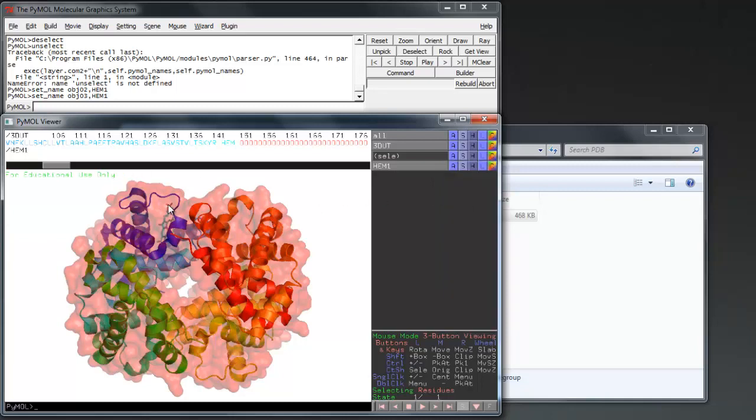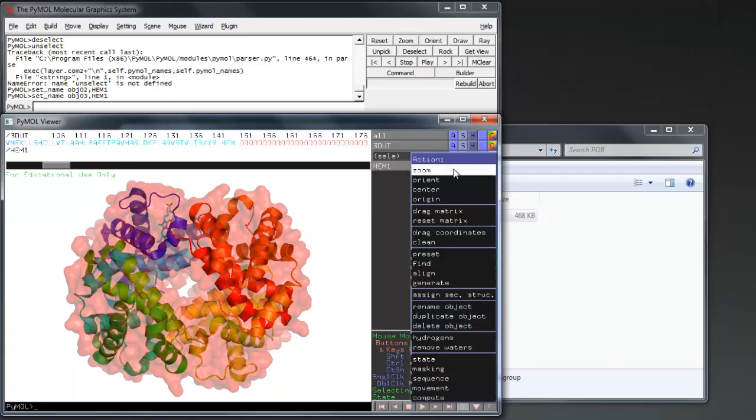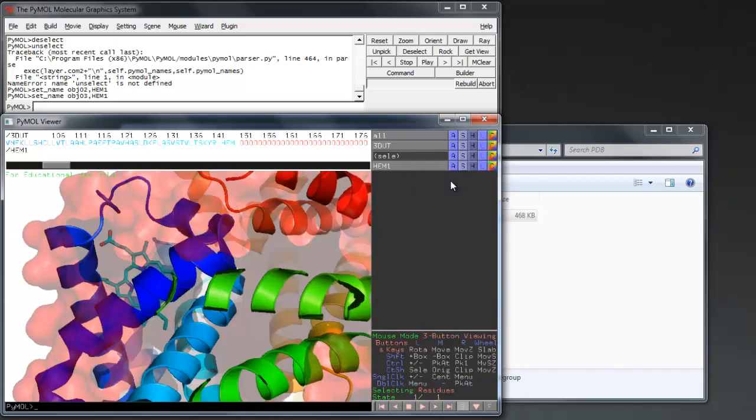Select your residue via the bar, then copy to object from the action menu before renaming it. Show your residue as sticks to accentuate them.